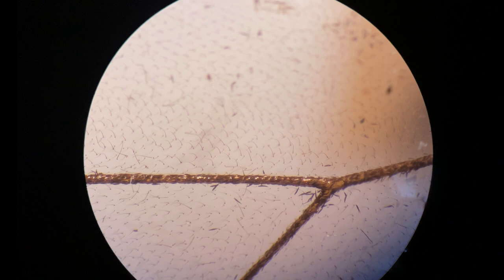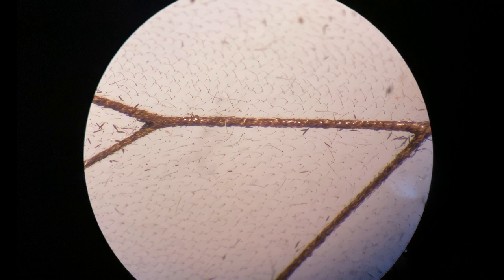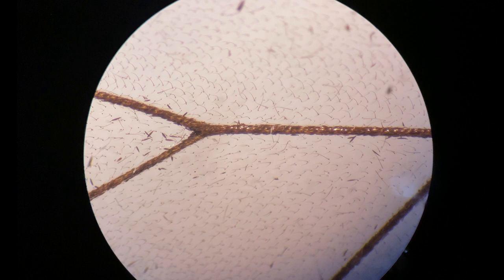I don't know if these are scales that are just very very small and fine like hairs. Or if there's something else. But here on the compound scope same thing. It just looks like a bunch of hairs. Like a hairy leg. That's so strange.